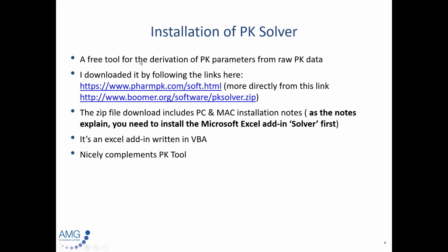In terms of installation, I downloaded it by following the links here. This is a list of various software that you might be interested in. Within it, this link to the zip file contains both the Excel add-in and installation notes for PC and Mac on various Windows versions.